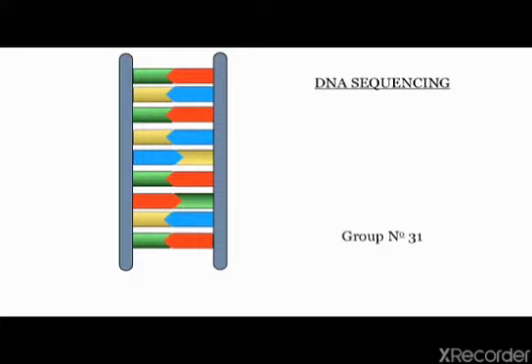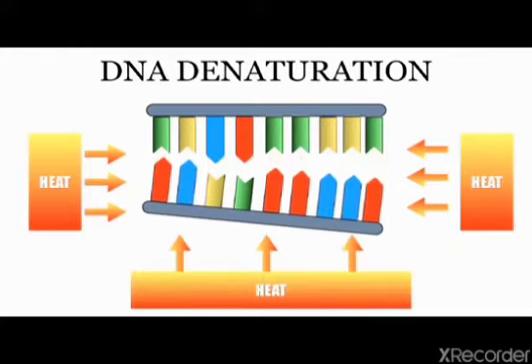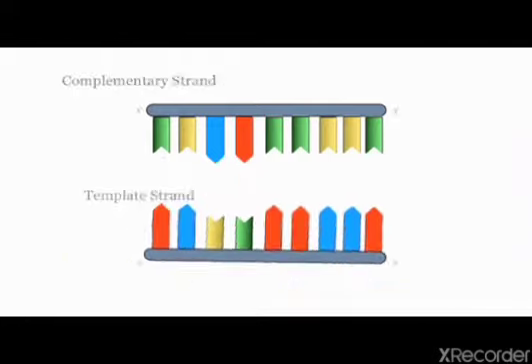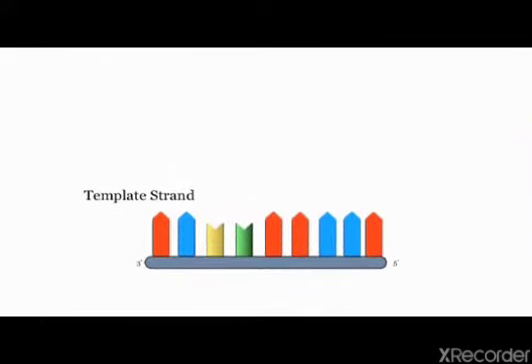DNA sequencing works. Firstly, the DNA to be sequenced must be denatured and converted from double-stranded DNA into single-stranded DNA. This is done through the application of heat. The DNA splits into a template strand and its complementary strand.